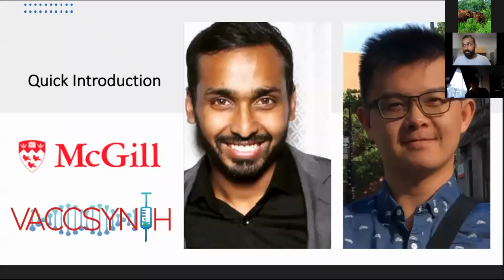For advancing sciences. And so using the ever-increasing power of computers, we can model mechanisms, we can analyze and predict potential outcomes, and analyze immense data sets. So in our presentation today, we'll be focusing primarily on the idea of analyzing and manipulating large data sets obtained from whole exome and whole genome sequencing runs to identify mutations and variations from the norm.